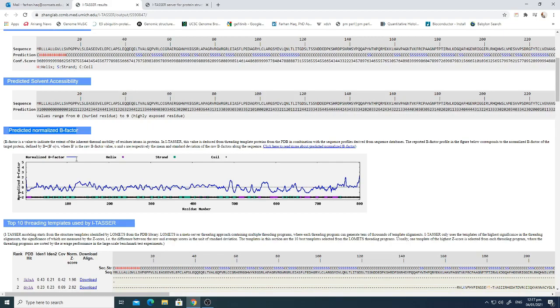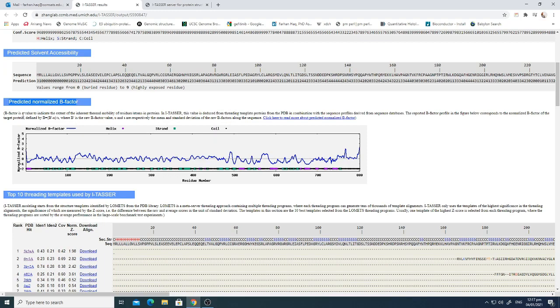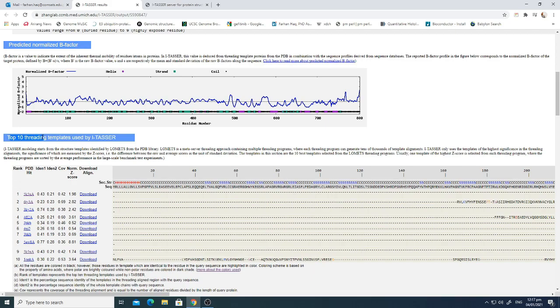There is also a predicted normalized B-factor, which is a value indicating the extent of the inherent thermal mobility of the residues.